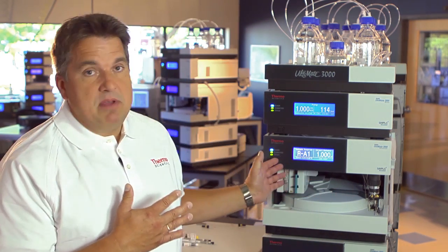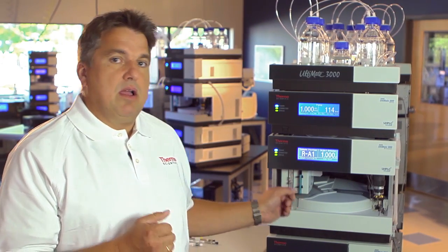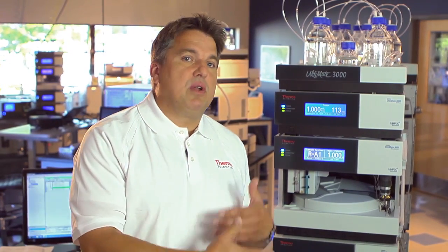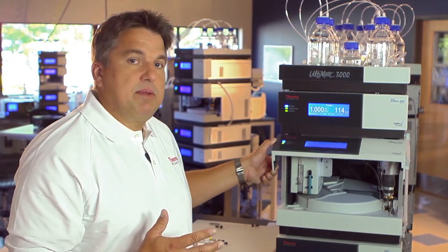Let me first talk a little bit about the hardware considerations when you want to move LC methods to UHPLC systems. The perfect option is obviously having a system which is able to run both types of techniques. We can achieve that in the Ultimа 3000 very easily by offering the same design for LC and UHPLC systems. Even if you have a 620 bar standard system which is UHPLC ready, you will be able to move back and forth between LC and UHPLC methods as long as you stay in that pressure range.